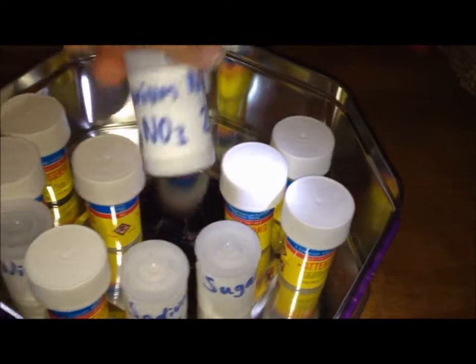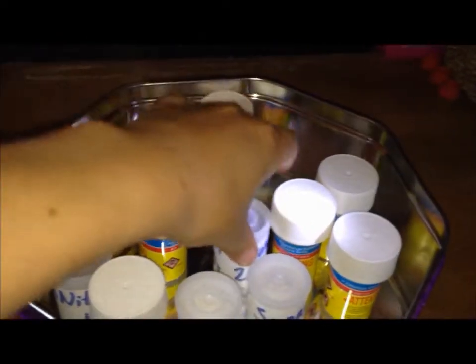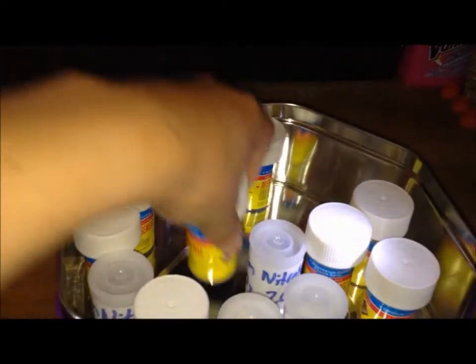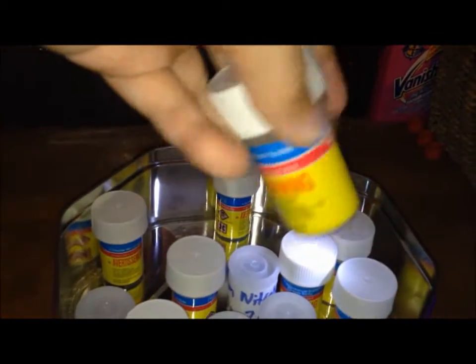In here I've just got some crystals that I made myself. I've also got some aluminium potassium sulphate, and some more crystals here — red crystals that I showed in the previous video. I also have some ammonium nitrate which I got from instant cold packs. Some potassium iodide — you can do elephant toothpaste with that, you can make iodine. It's quite useful.